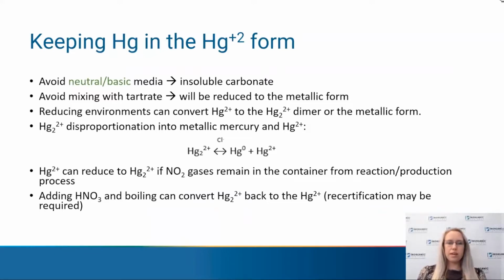One thing that we use at Inorganic Ventures is tartrate for stabilizing antimony. So we have to be careful that if we have a standard that contains both mercury and antimony, we're using antimony stabilized with HF instead of tartaric acid.